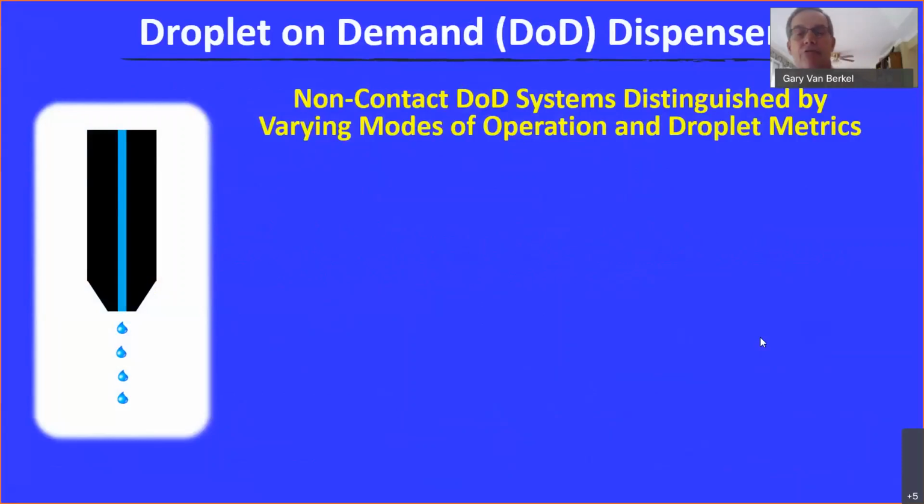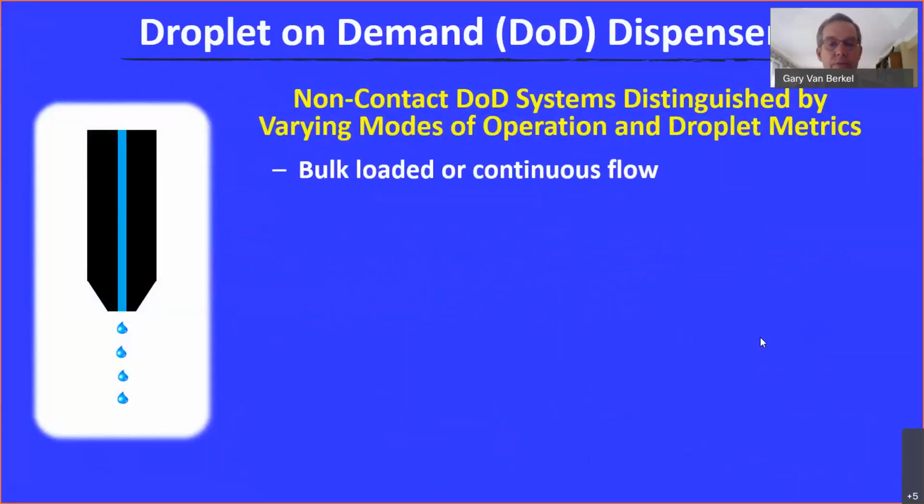So non-contact droplet dispensers, they have various modes of operation and different droplet metrics.